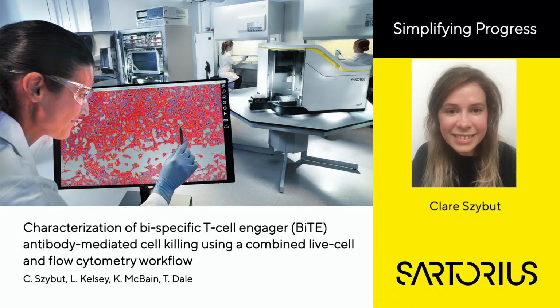The development of novel immunotherapies depends on the ability to quickly and effectively evaluate how well these drugs stimulate the immune system in order to destroy tumour cells. However, with complex biology in play, it is vital that meaningful data can be collected in vitro in order to better predict how effective a drug will be by the time it reaches human testing.